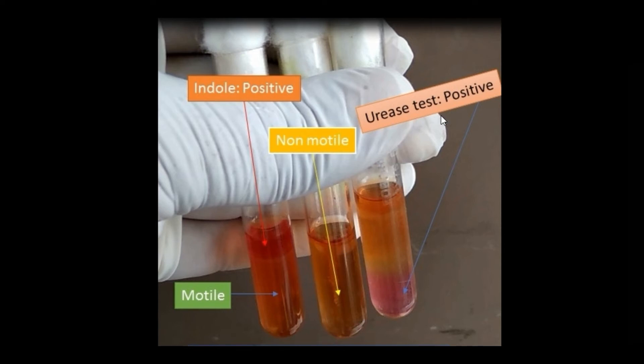Now about urease test. Pink coloration of the medium indicates the organism is urease positive.